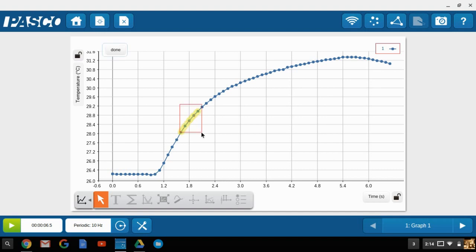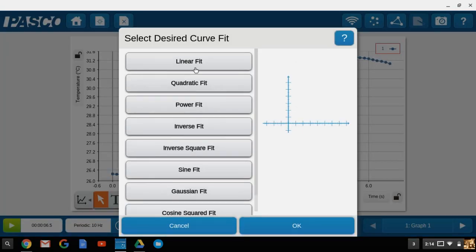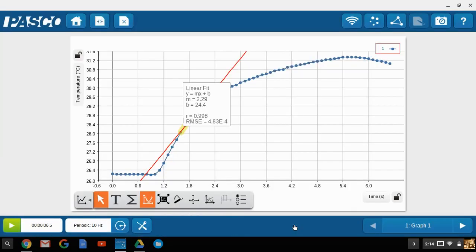Click, hold, and drag over the area that you want to analyze. Click on done. Then you can go down and select the curve fits, and we can select a linear curve fit, and select OK.